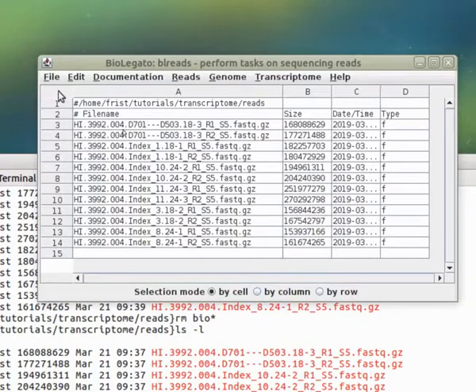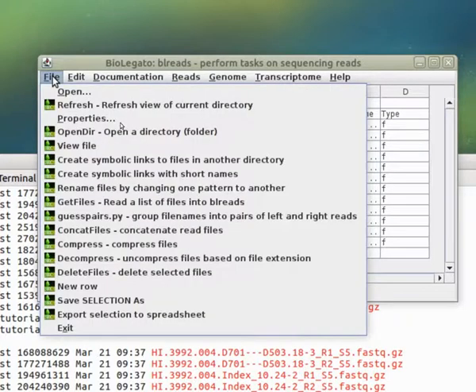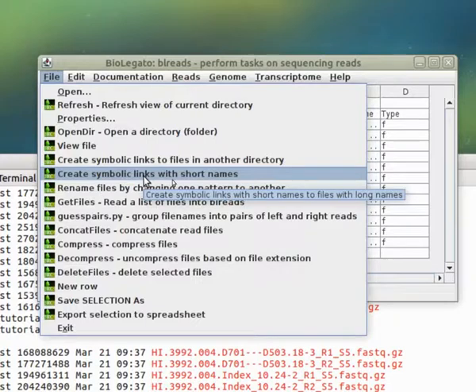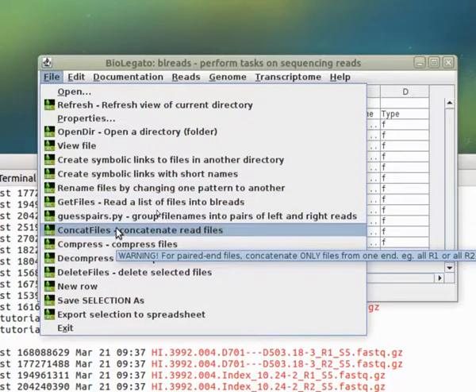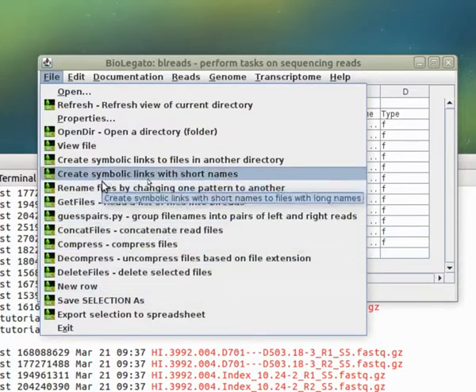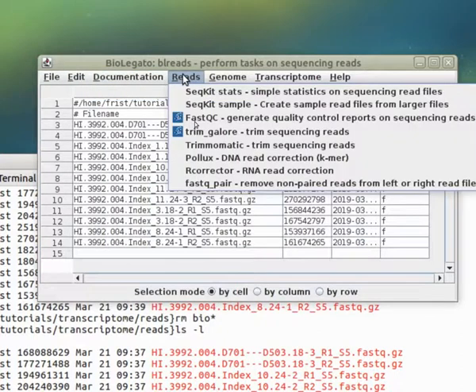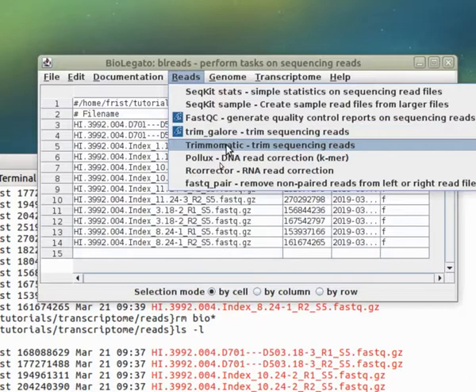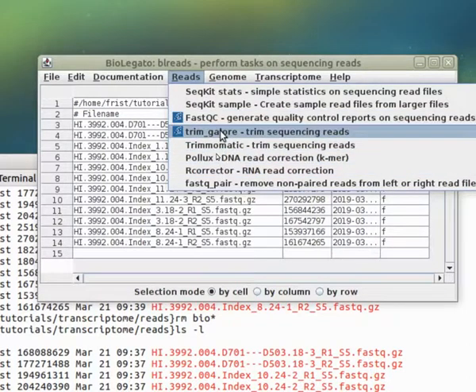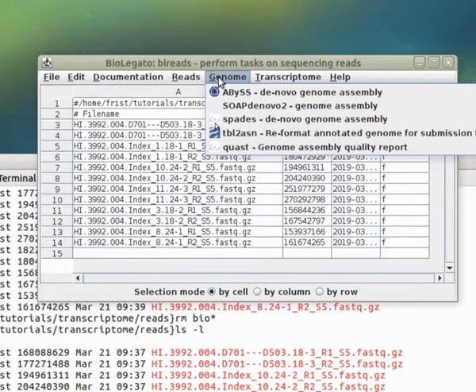First of all, to give you an idea of how BL Reads works, we have various file tasks. In a moment, we're going to create symbolic links. You can do other things like compressing files, decompressing, deleting files. All of the tasks you might do on reads, like getting statistics, trimming them, correcting them, can be done in the Reads menu. For assembly, we have a genome assembly menu that runs different genome assemblers, a transcriptome assembly menu that assembles transcriptomes and generates gene expression data using the HiSat string tie pipeline.